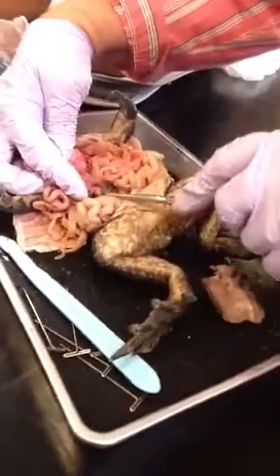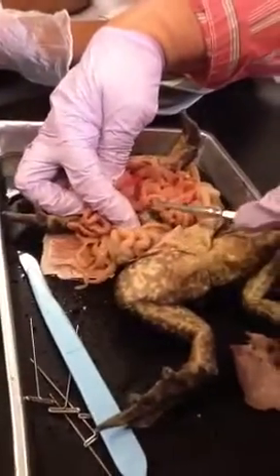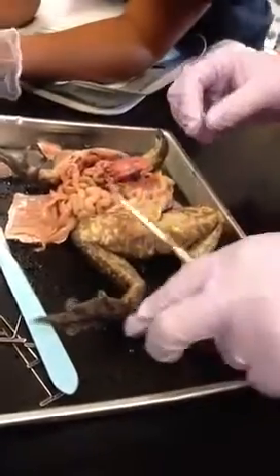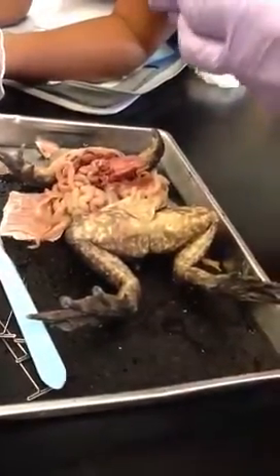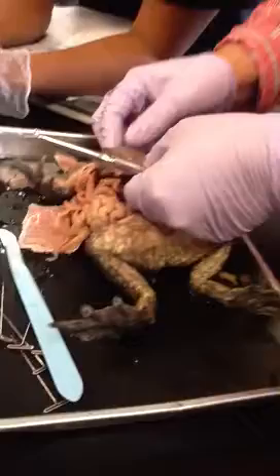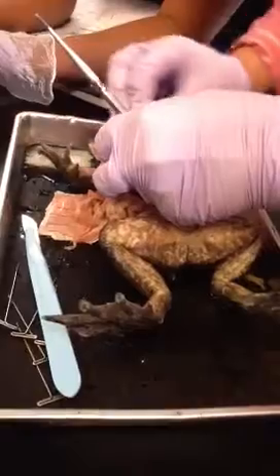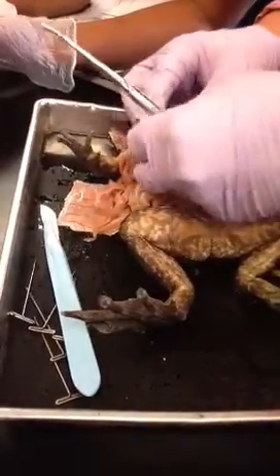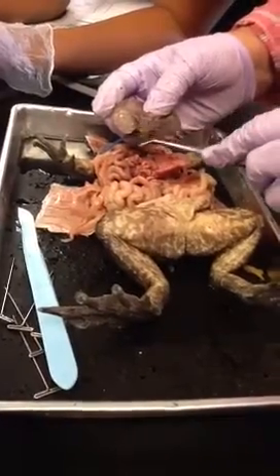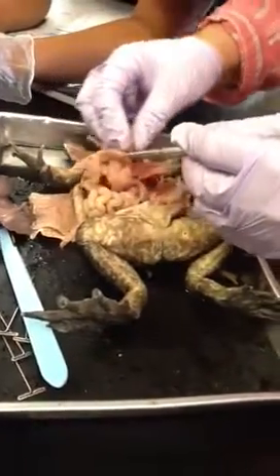All over. And then there is the spleen. Oh, wow. That little red structure right there, that's the spleen. Okay. All right, and the liver. Okay, you have the liver here. All right, I would put that one right up in here, and so you pulled it up. Okay, this is the other piece. Make sure that goes back in before you put it away. This is the gallbladder. Okay, it stores bile. All right, these finger-like projections.